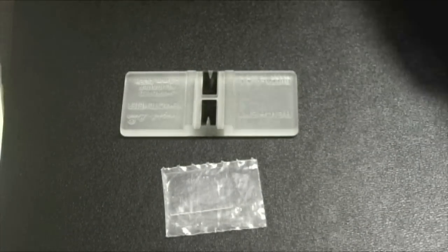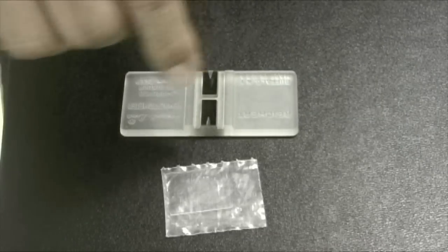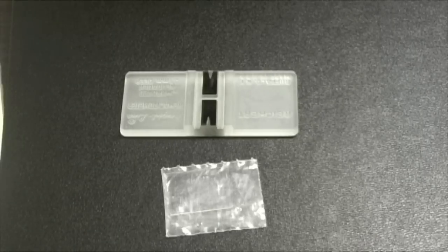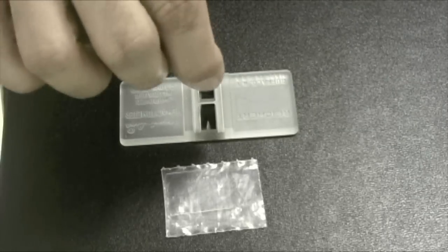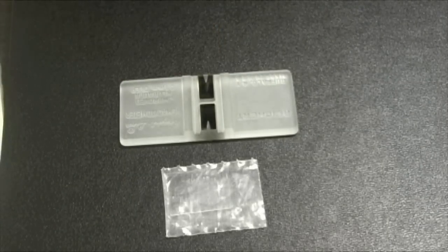Now, this is specially etched glass, and it's been optically ground flat with diamond powders and paste to give us a good surface. When we get under the microscope, there's a very small grid that's been put onto the surface of the glass that we can use as a counting area.